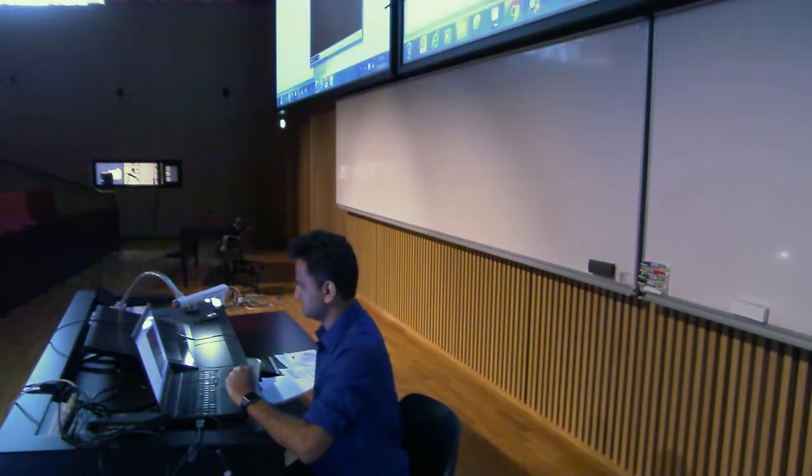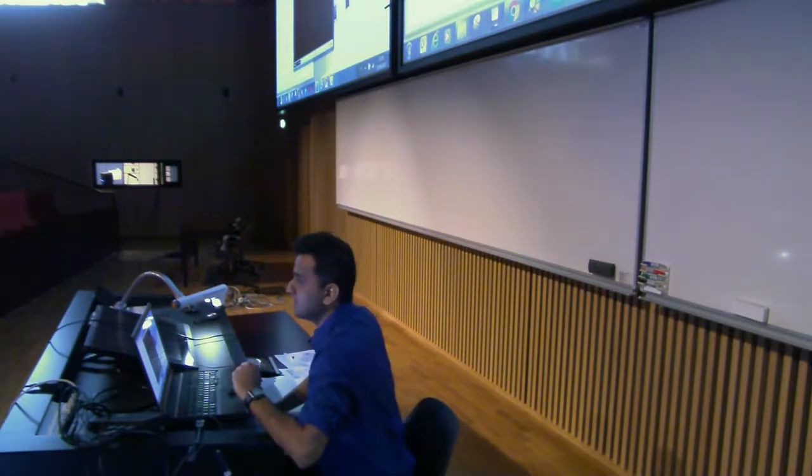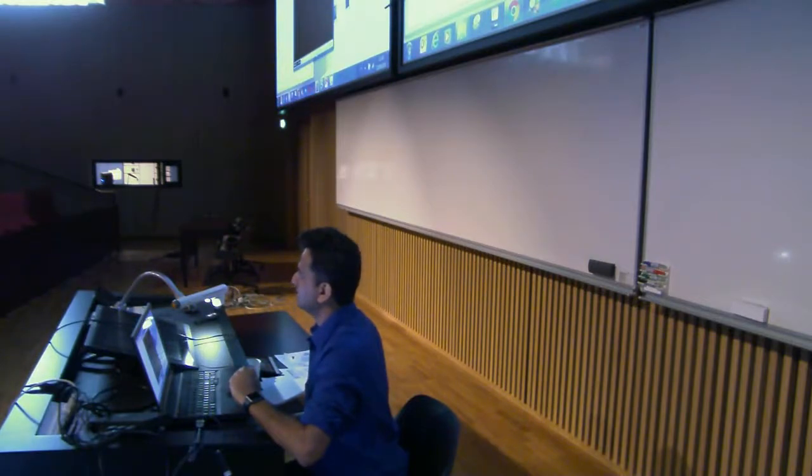Of course it is very premature in that way. But at least you are able to see what is there in your data set, at least at your computer, if the Imaris is busy. So at least you should check what is happening. What you can do is, yeah, exactly, because it needs a lot of graphics power, yeah.